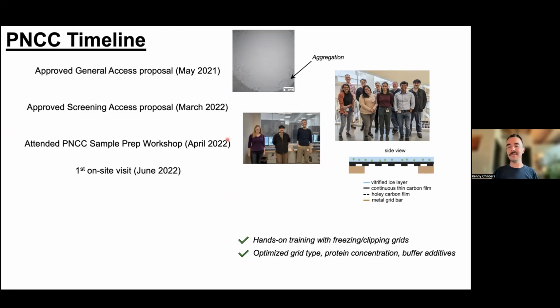And Omar, I think on the second or third day, pulled me aside and said, "Well, we have these other grids that have a continuous substrate, and they're really for finicky proteins that don't like to get in the holes and don't stay frozen in there as single particles. So let's go ahead and try them." And it turns out that was the key. It brought our particle into the hole, and we were able to collect high resolution data on it, as well as troubleshoot some protein concentrations and some additives.